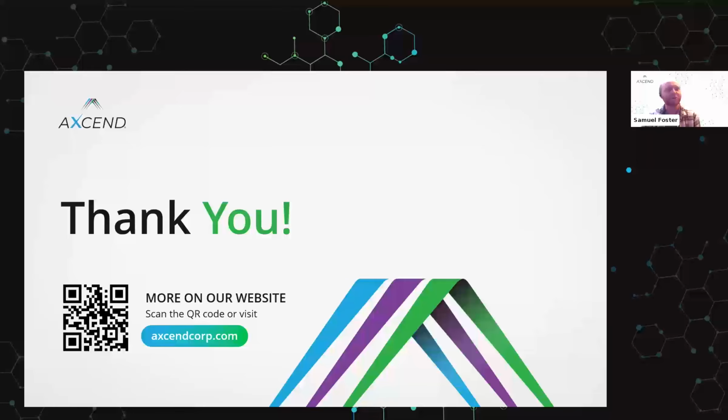Have you tried particle beam MS for capillary LC? I have not. That sounds really interesting. Do you have a particle beam MS? I'd love to try. That would be sweet. We should chat. Oh, we should chat. That would be really cool. I would love to get my hands on one.